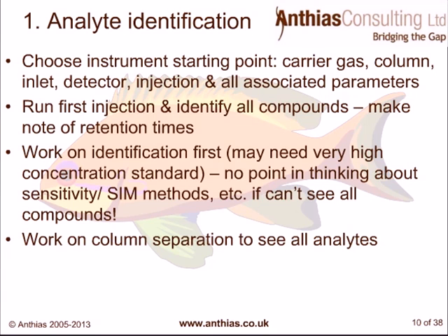If you're not sure, go into the kind of part per million sort of level to maybe a 1 microliter injection, and then you could go through and see if you can see something. If you think it's too high a concentration, the best thing to do is to start off with a split injection, so you're not getting all of that standing onto your column, and therefore you're not going to be contaminating your system.